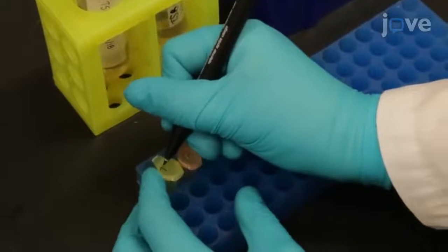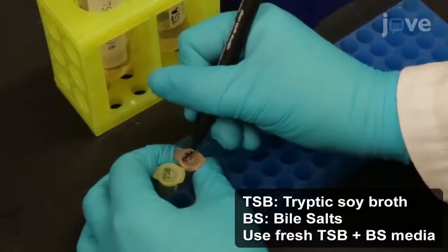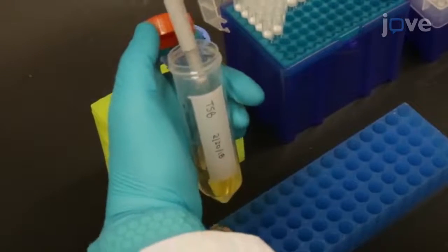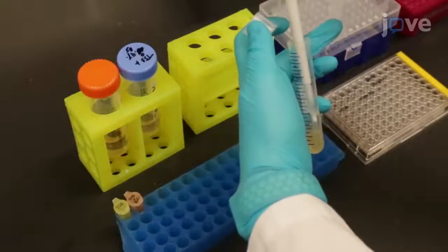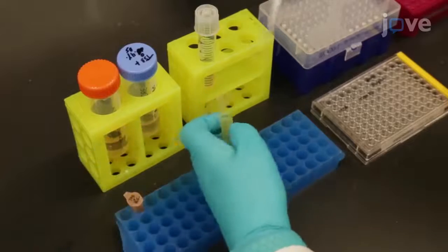First, label 2 1.5 milliliter tubes as TSB and TSB plus BS. Then add 1 milliliter of TSB or TSB plus BS to the respective tubes. Next, inoculate the tubes with 20 microliters of overnight culture at a 1:50 dilution.